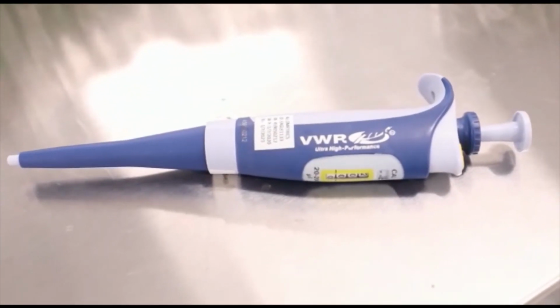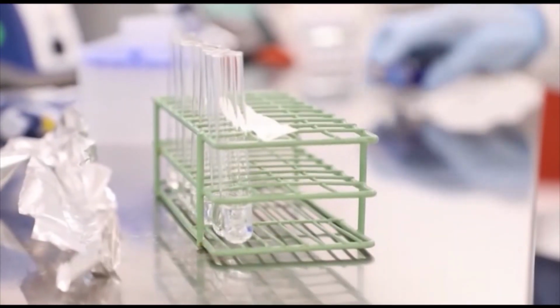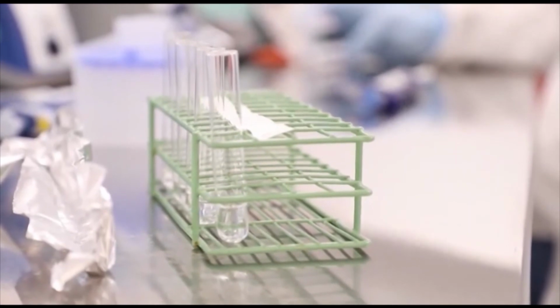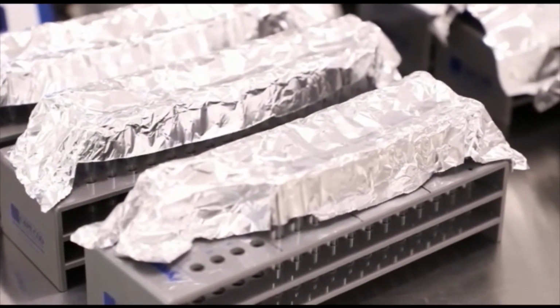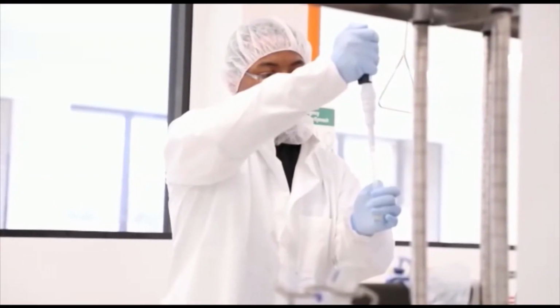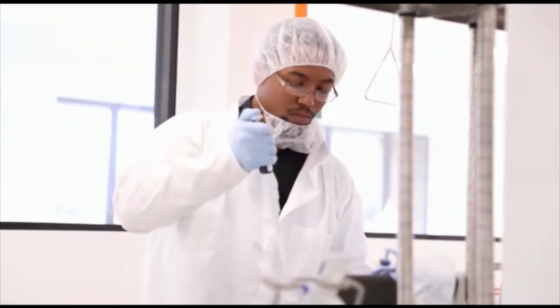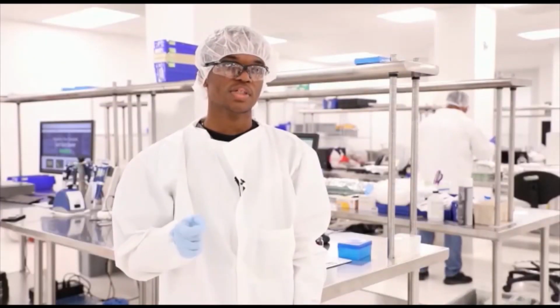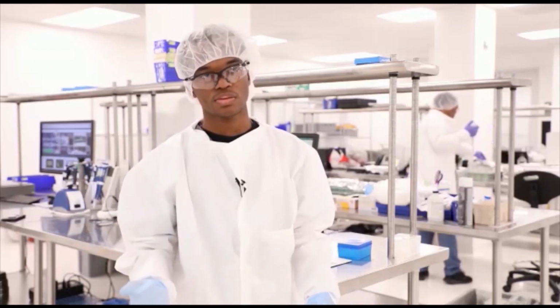During the test, we use an LAL test, which is a limulus amoebocyte lysate test. The Limulus polyphemus horseshoe crab has amoebocytes, which we extract from them, and upon contact with endotoxins, they cause a coagulation reaction. The instrument measures when the coagulation reaction occurs.